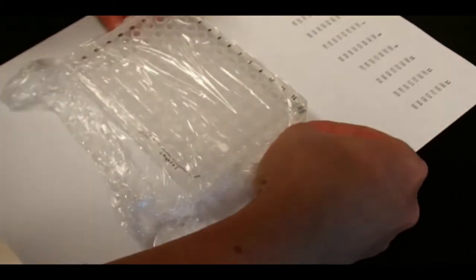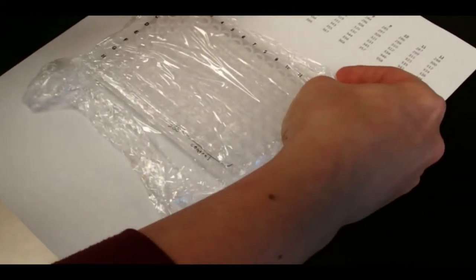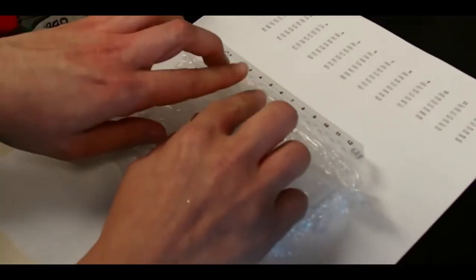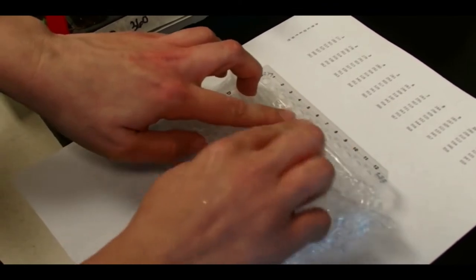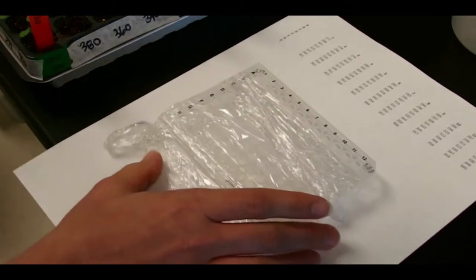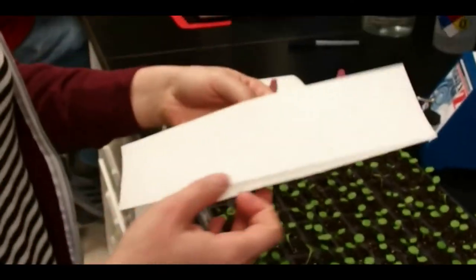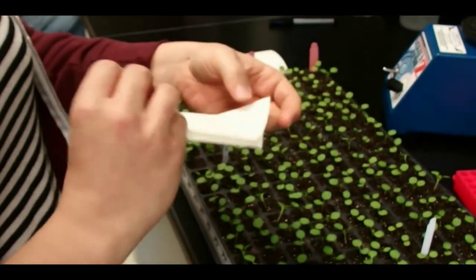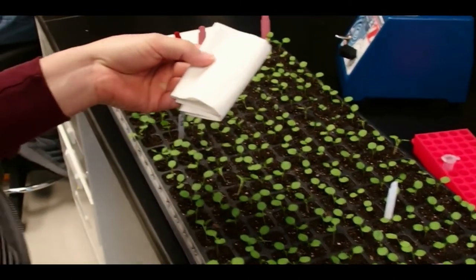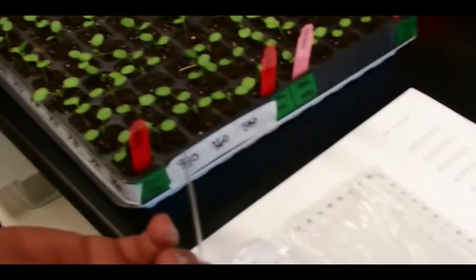So first, Sarah is opening up just the first row. We'll keep the whole plate closed other than what we're working on. And then she's going to punch against clean paper towels so that we don't cross-contaminate. Cross-contaminating of plants is the only thing we're worried about. We're not worried about getting our skin. We're not worried about getting dirt. I mean, these plants are grown on dirt. What we're worried about is cross-contaminating plant to plant.